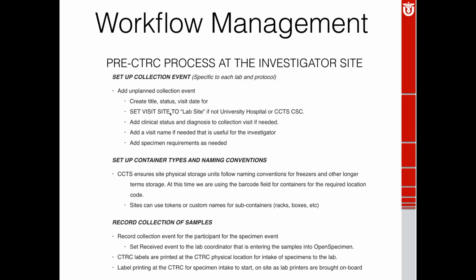So we'd like to standardize that so it happens before they actually even walk in the door. And that way the processing lab can just move on with their work and not have to deal with any data entry errors either.